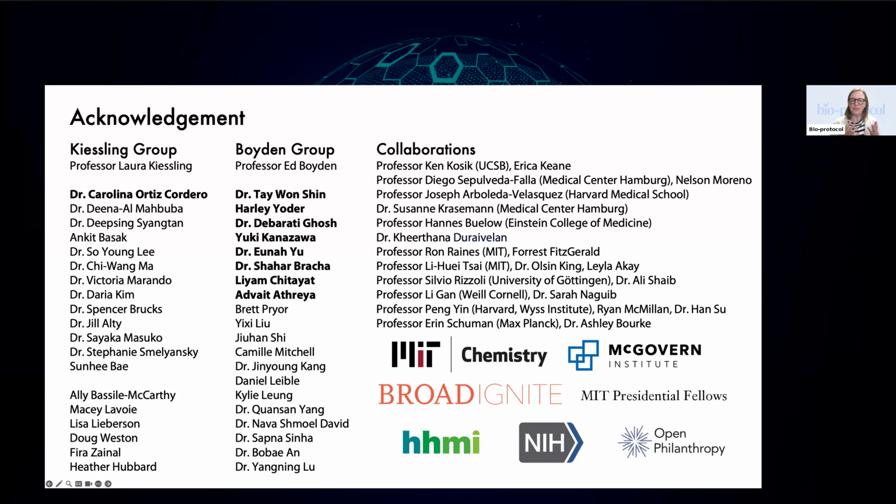How are the physical properties, the sliminess or rigidness, of the DMAA gel compared to normal or more traditional ExM gels? It should be quite easy to handle, especially when it's in PBS. We don't recommend handling it in water when it's fully expanded, because then it's so big and more fragile. It's really difficult to handle. So we recommend all the handling steps happen in PBS. Usually in PBS, even if you just pick the gel up and transfer it, it shouldn't fall apart because it's quite robust.